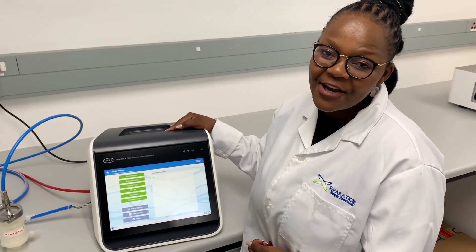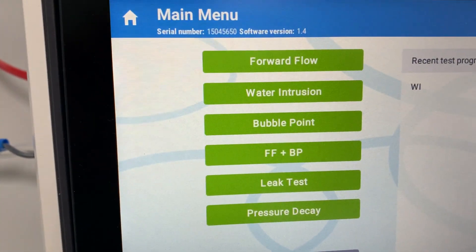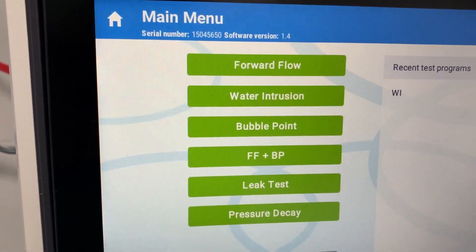All the standard filter integrity tests are available: forward flow, water intrusion, bubble point, forward flow and bubble point, leak test, and pressure decay.